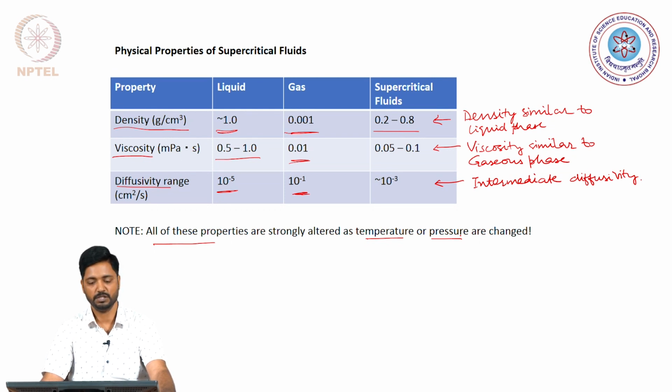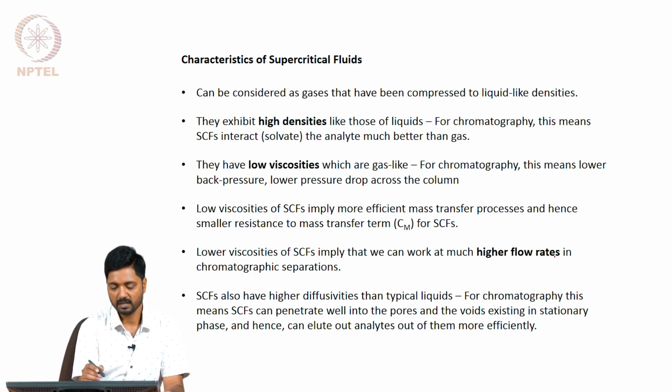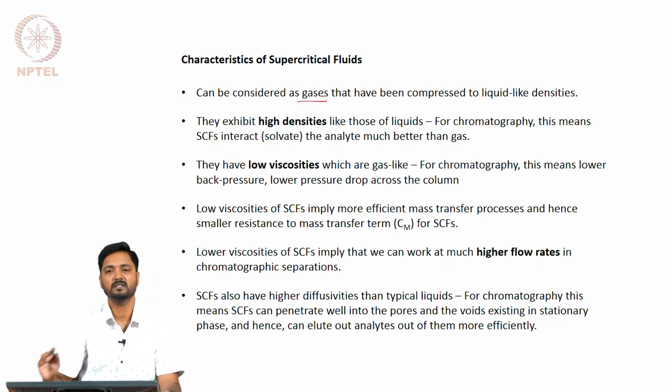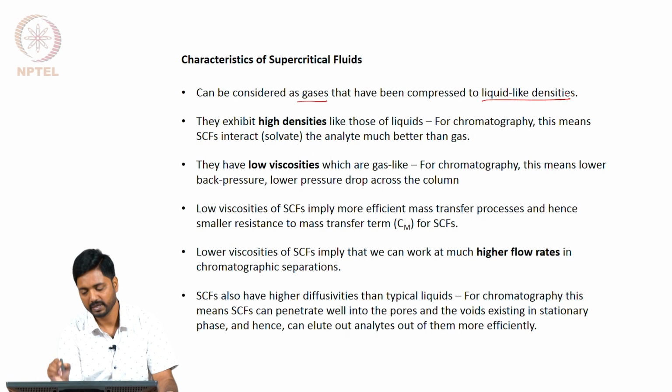performance regime. So, what are the characteristics of the supercritical fluids? They can be considered as gases, but gases that have been compressed to liquid-like densities.